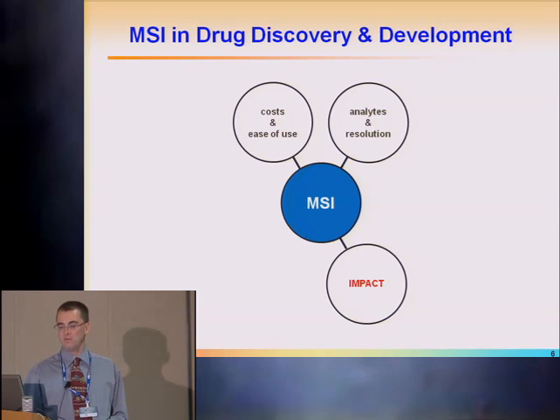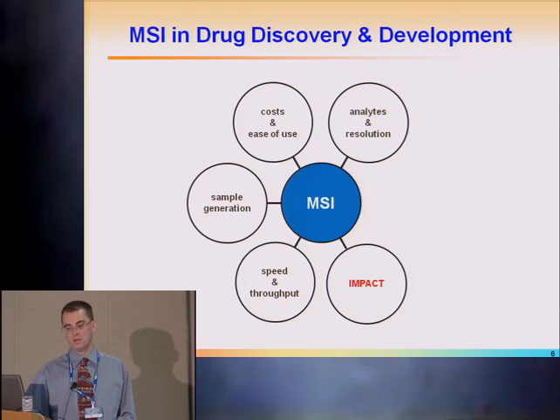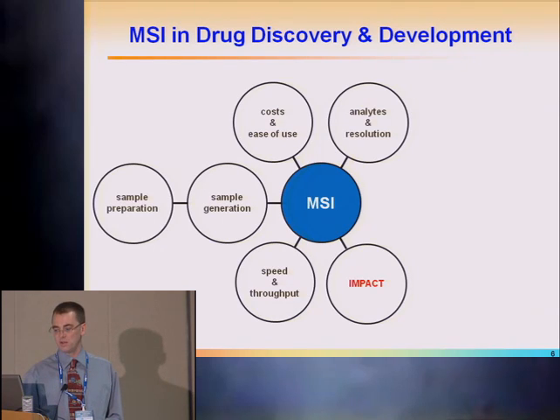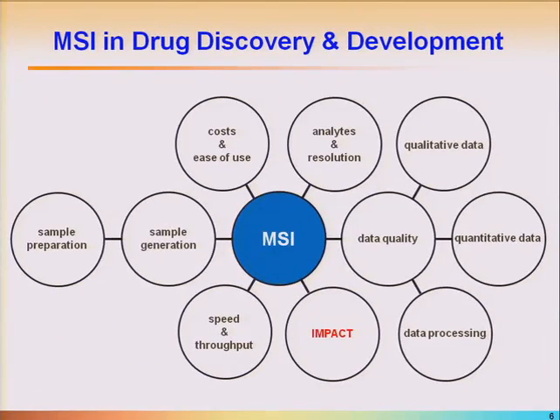What analytes can we see? What is the resolution? What is the speed and throughput? How difficult is it to generate the samples or even prepare the samples? What is the data quality? Will we have qualitative data, quantitative data? How difficult is the data processing?